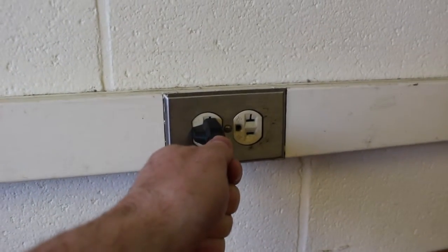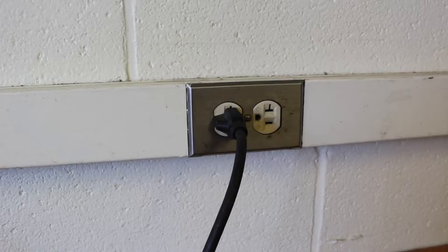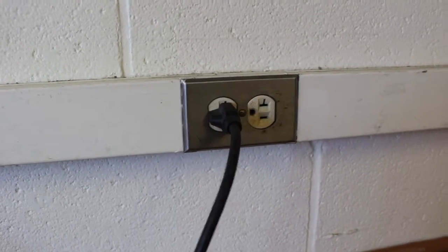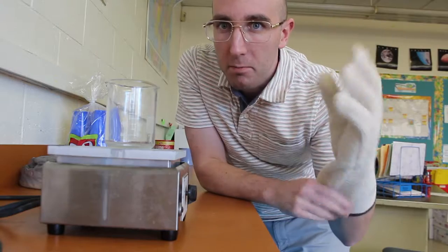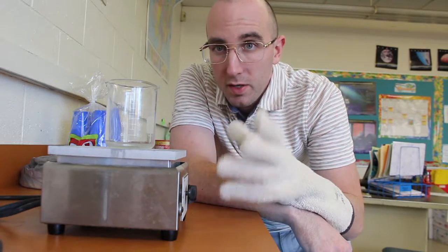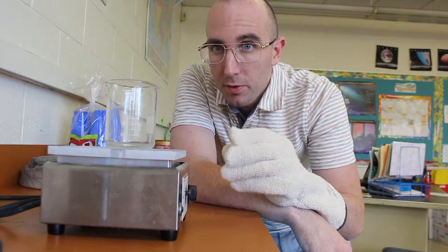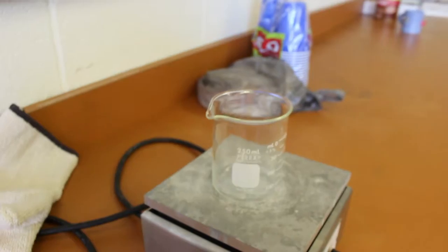Another thing — and this is a pet peeve of mine — you should never just unplug something. Always take the effort to turn it off first, then unplug it. This prevents surges that can hurt the machines. But the most important thing about working with hot plates: you need proper hand protection when taking something off a hot plate. You can't always be 100% sure something isn't still heated, so always use a protective glove.